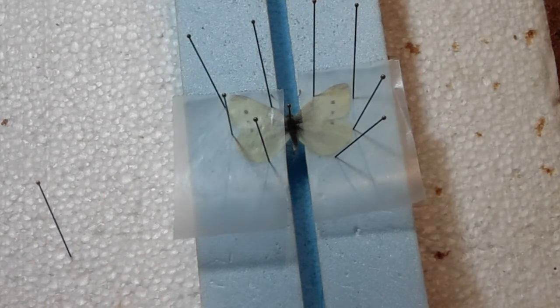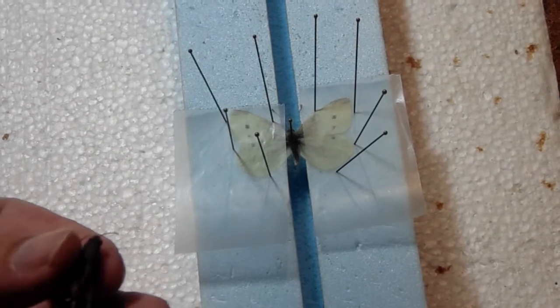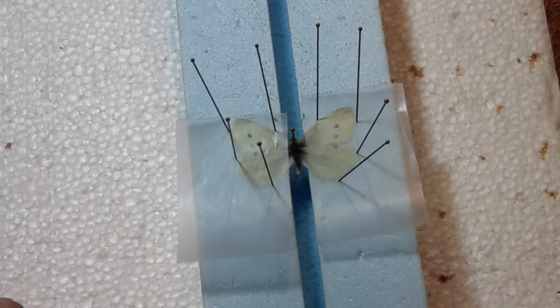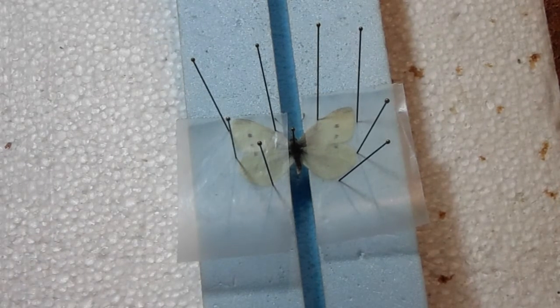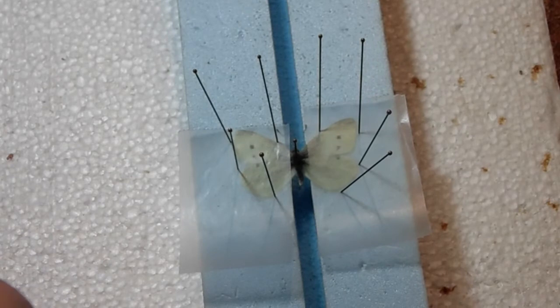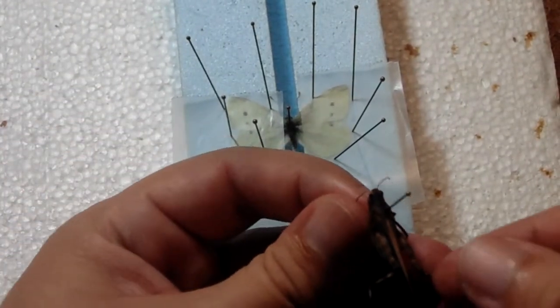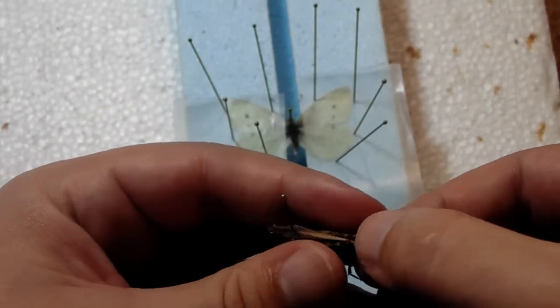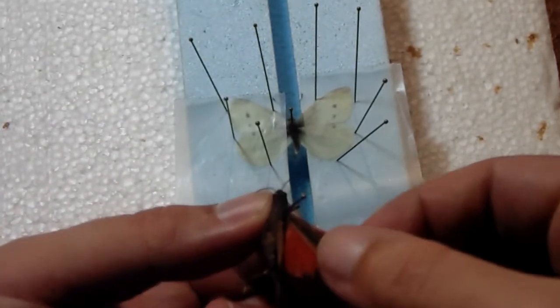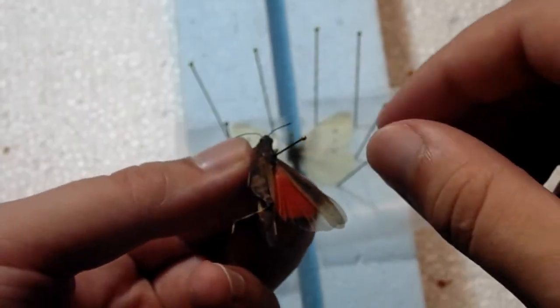That's the butterfly, so next I'm going to do the grasshopper. Like in part one, you pin the grasshopper on the right side of the ridge on the thorax. Set it to the height I want, make sure the hind legs are down. Then carefully take one of the wings and open it up. You can see an absolutely gorgeous red hind wing right there — that's what you want to display, it helps with identification.